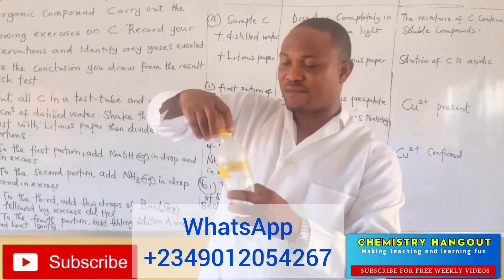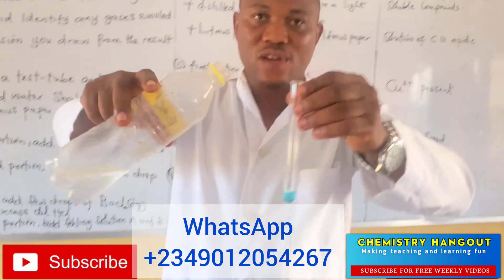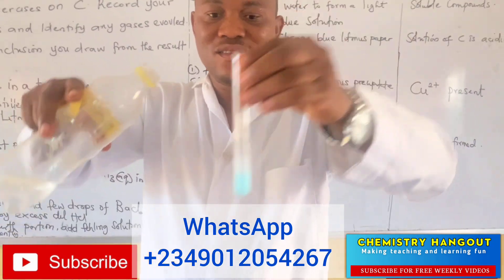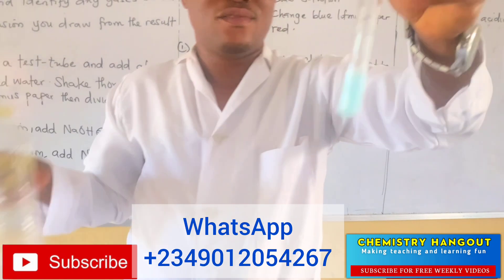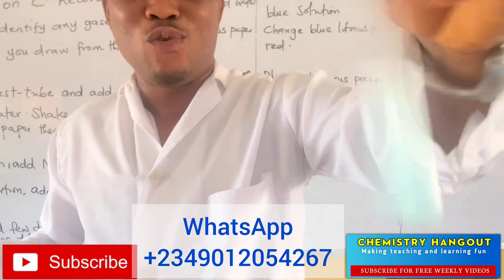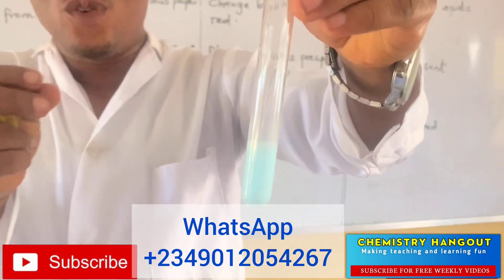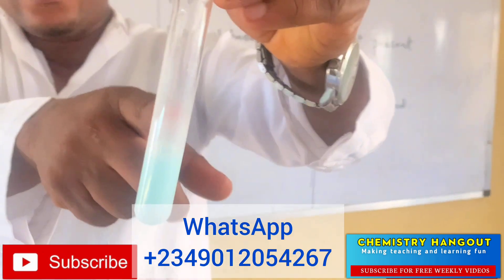Barium chloride — look at that. This is the top portion, so let's see barium chloride. Did you see what is changing? The white is standing — look at it. The white is standing on the walls like chalk. You know, like you are grinding chalk and putting it in water — that's what it's looking like.